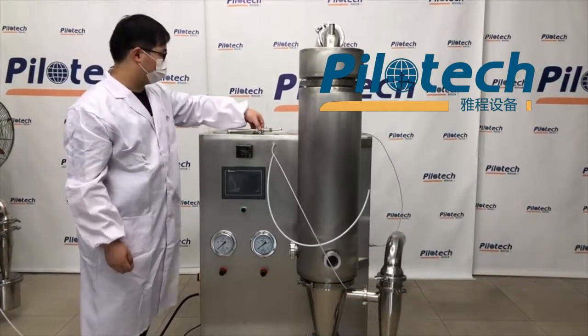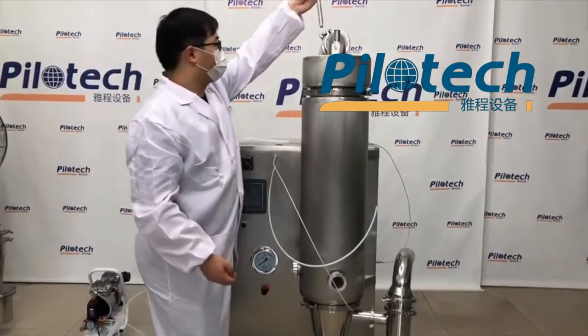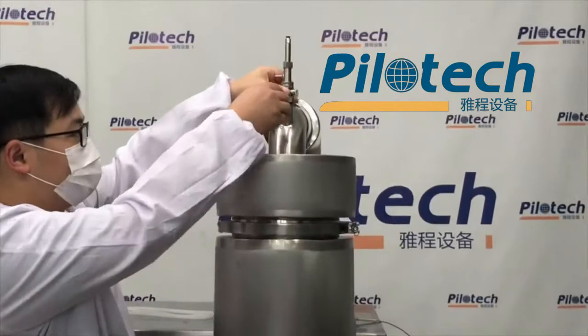Today, let's install the Pilotech spray dryer. First, we need to install the atomizer.